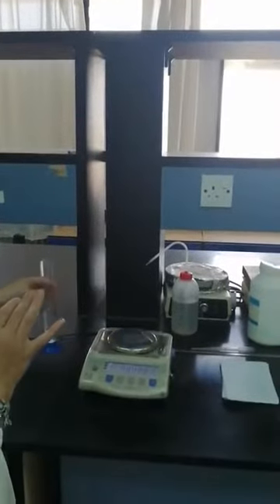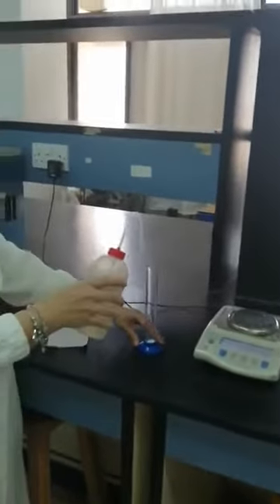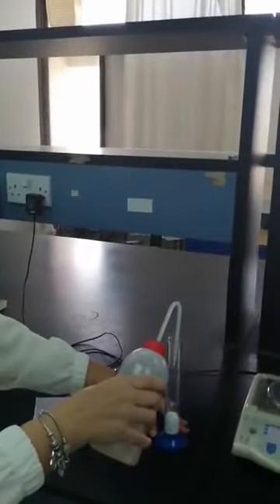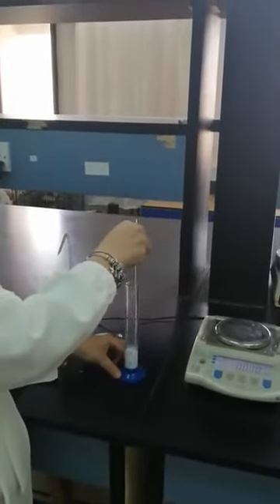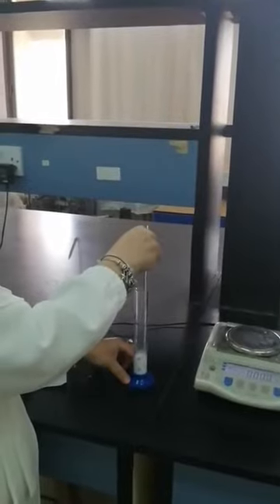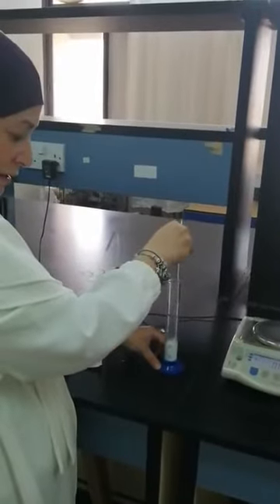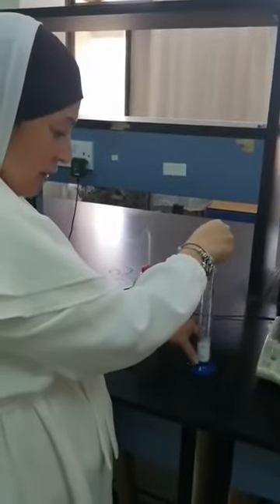Then the next step is adding the replacement liquid, which is water. As we said, we will add water up to 20 ml because zinc oxide does not dissolve in water and it is just wetted by water, and we have to enhance water entering between the particles and intervoids. We have to stir it because really we have very fine zinc oxide.